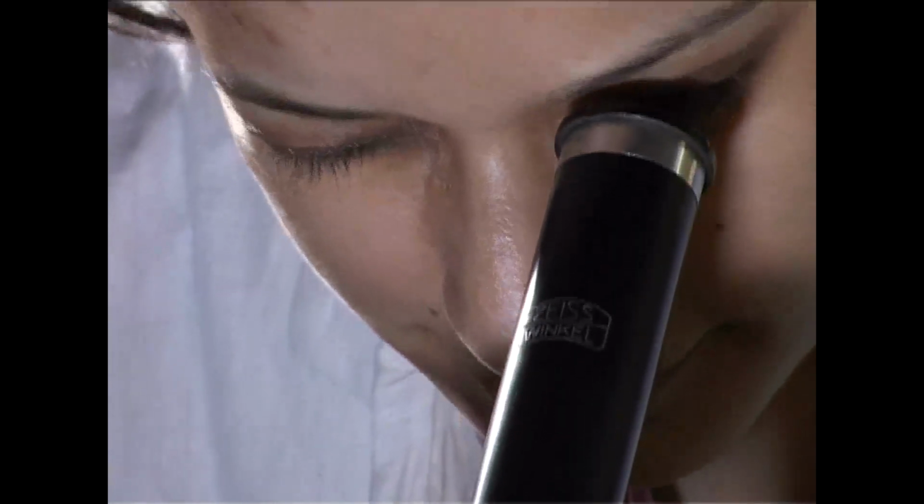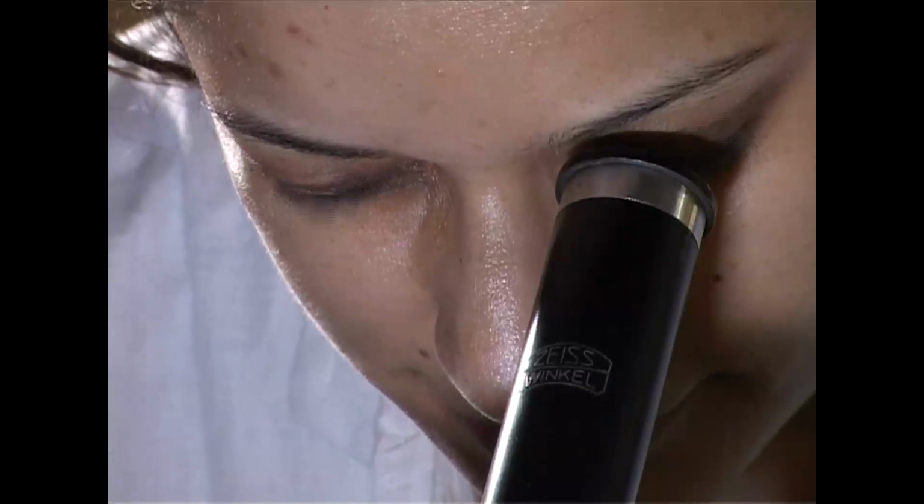The observation is those organisms which have mycolic acids in their cell wall will retain the primary color, that in this case is carbolfuchsin. And once you heat the organism, then carbolfuchsin is retained in the cell wall of Mycobacterium. And hence it will not be lost during the decolorization step. That's why it is known as acid fast. It is able to resist the decolorization by acids also.